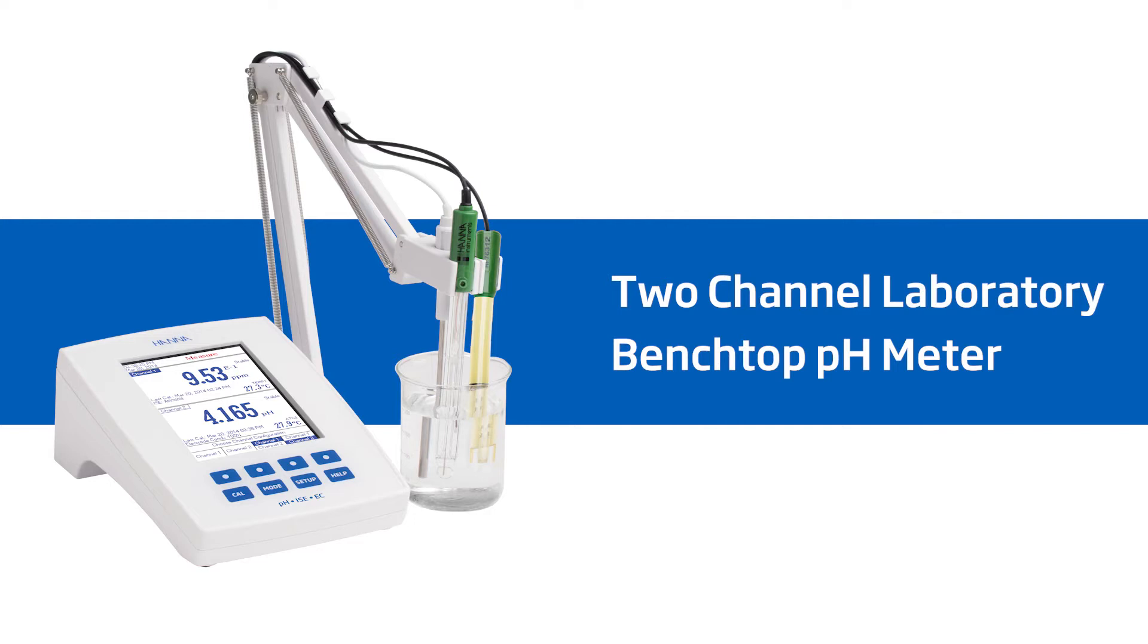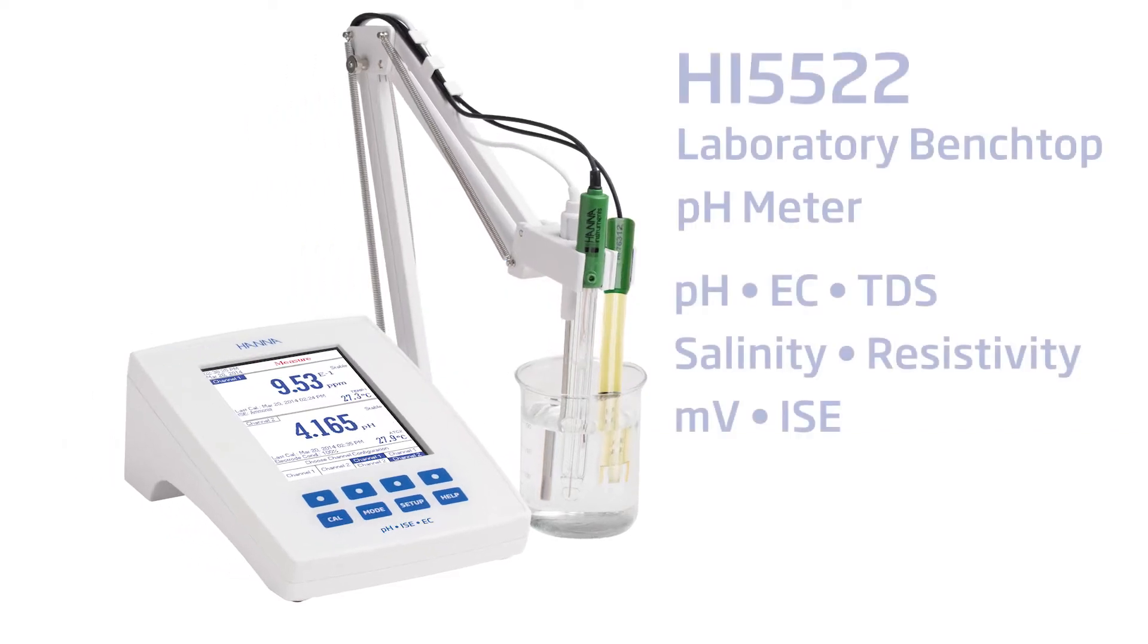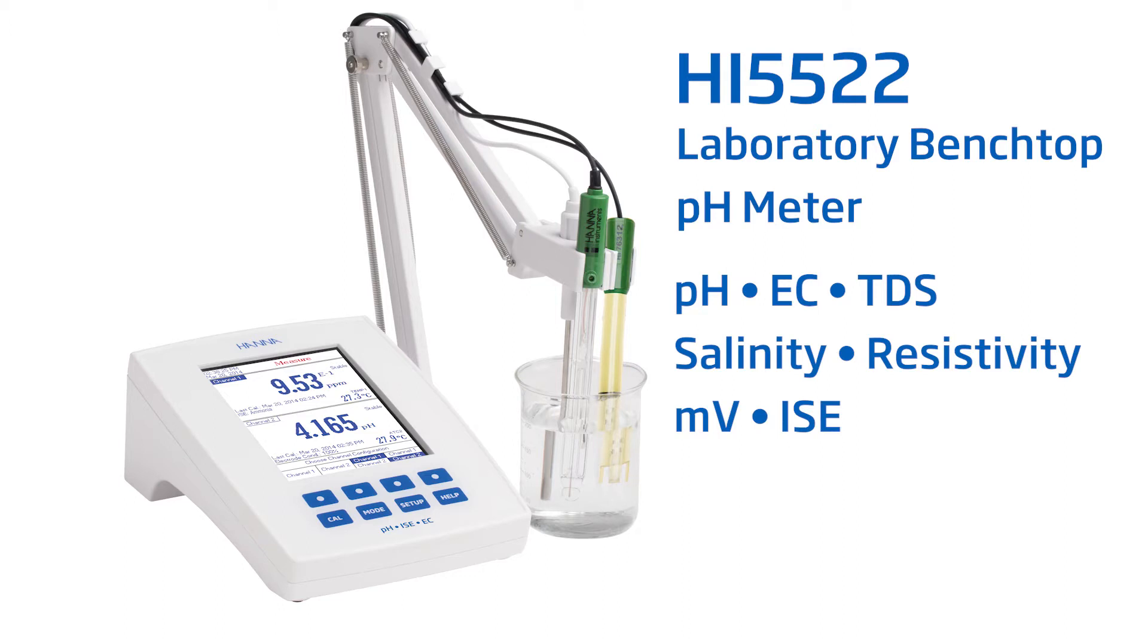This meter is perfect for labs who have multiple tests performed on one or many samples. The meter supports pH, electrical conductivity, TDS, salinity, resistivity, millivolts, and ion-selective measurements. This benchtop pH meter is an essential tool for any lab.